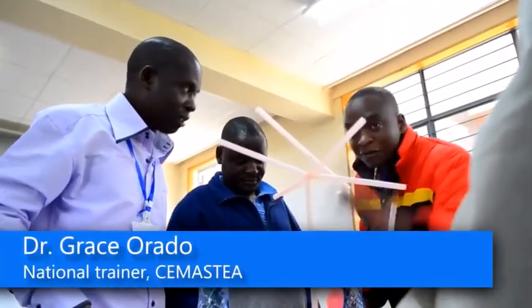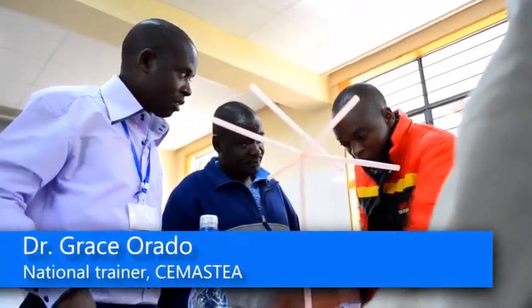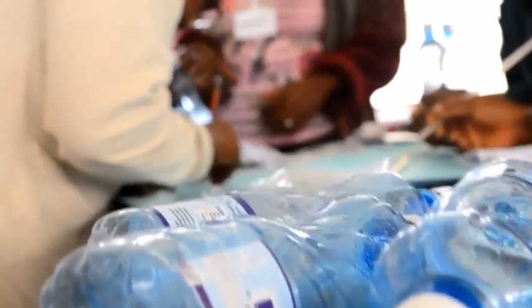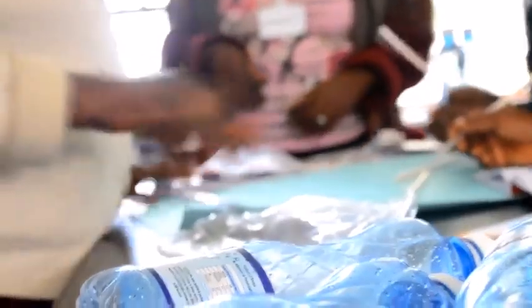During INSET, we train teachers to be innovative so that they come up with teaching-learning materials using locally available resources. One area we have done that is in coming up with one of the apparatus used in the teaching of fractional distillation or simple distillation. That piece of apparatus is known as the Liebig condenser.